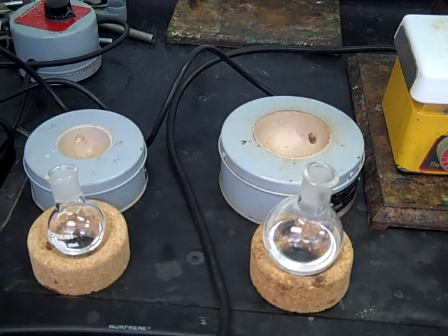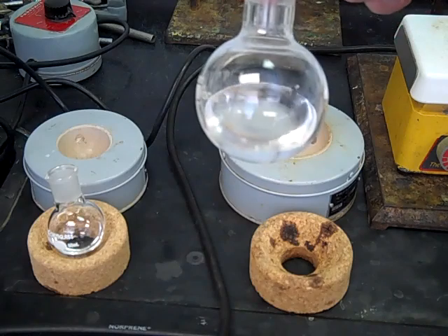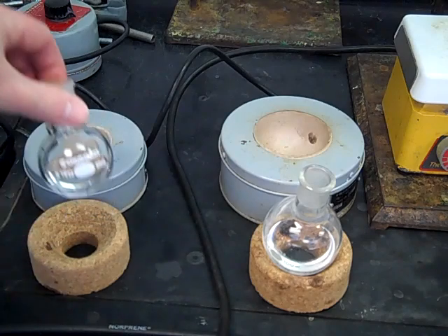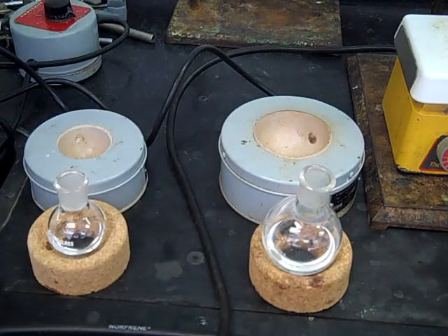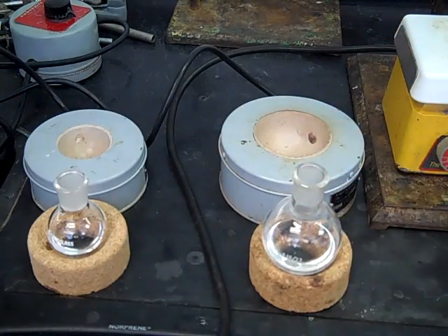Here are all the pieces we're going to need for our reflux. The first thing is a round bottom flask. Depending on how much liquid or volume you're going to need, that can determine whether you use the 100 mL round bottom — you can see we only have it about a third of the way full — or if you have less material, you could use the 50 mL round bottom flask. The general rule is to never fill those round bottom flasks more than half full; you always want to be under half full.